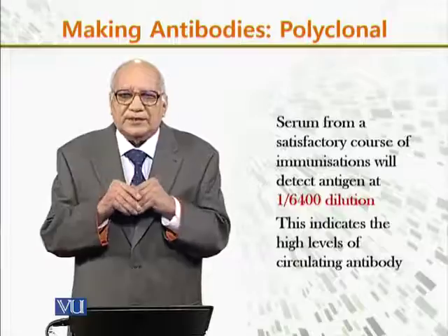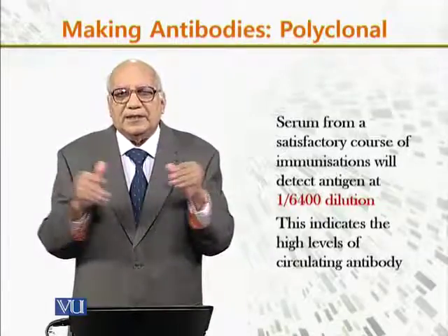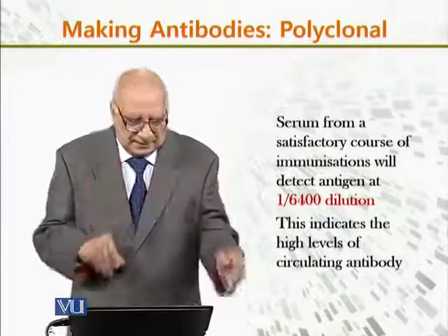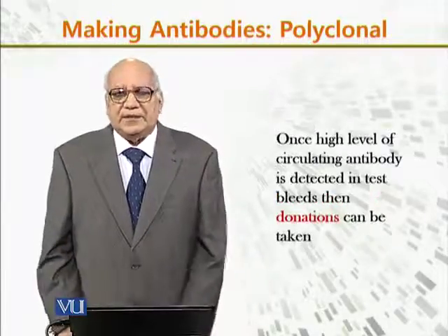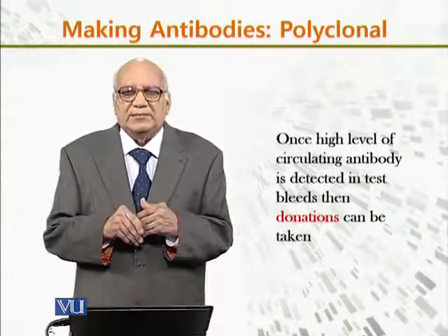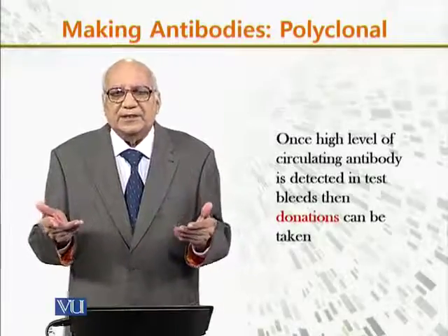This indicates a high level of circulating antibody, up to that dilution the antigen can be detected. Once a high level of circulating antibody is detected in test bleeds, then the donation can be taken.